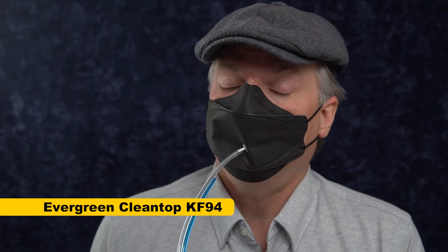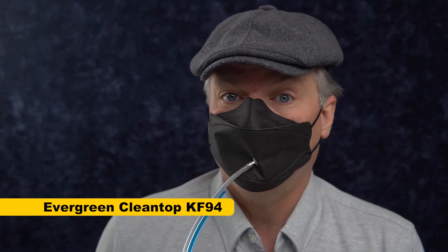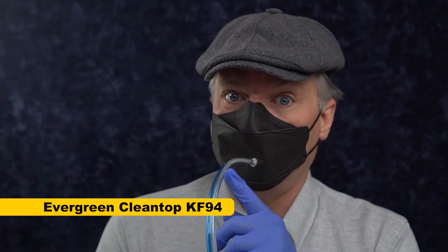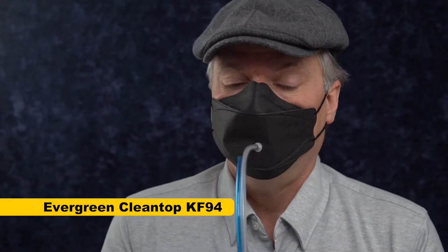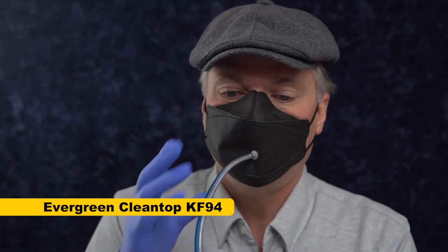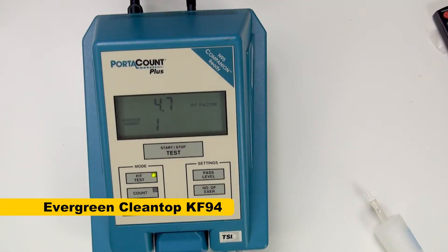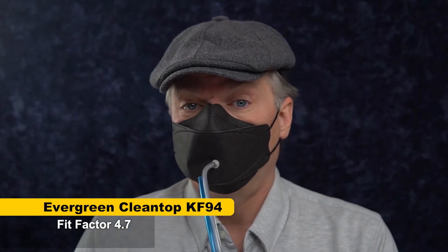So this is the Evergreen Clean Top, and I can feel that even as I'm talking, these ear loops are just too weak. As I talk, the mask is coming forward. A little bit of that is the sampling hose, but most of it is just weak ear loops. I can feel a little bit of leak. Score: 4.7 — not great, a little bit better than I expected based on how much air I could feel going past my nose.